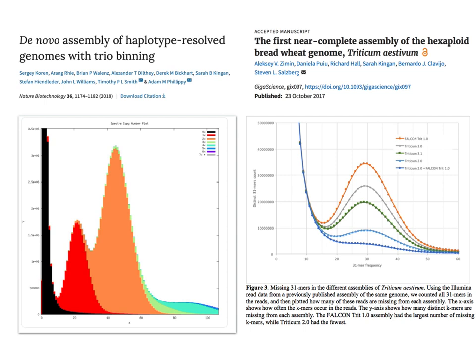What you can also see is that there's a little bit of a red bar at zero frequency on the reads. That means there's some content that appears just once in the assemblies that was not present in the Illumina reads. Now, most of the time in this case, those are going to be small one base pair errors or insertion deletions on the assembly, where the consensus accuracy is not quite perfect, but this is a really nice result.